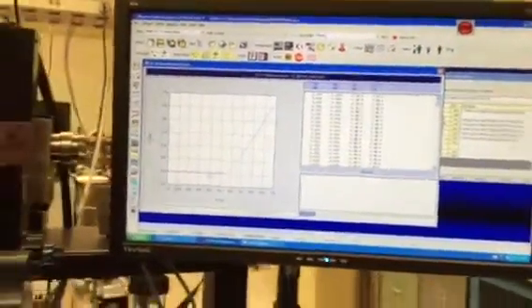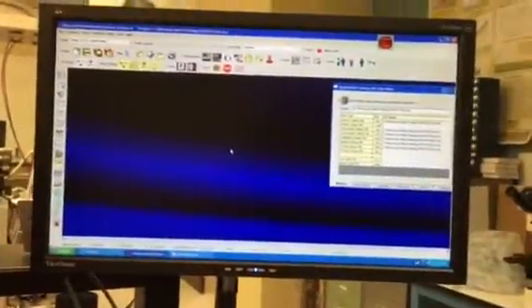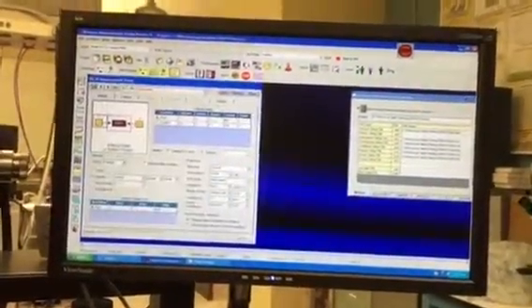You may see differences in the data down here. That's where you can see the noise. Okay, so that's basically we have a single measurement now that we can work with. But now we'll move to setting it up, and you can play with that. You can decide here how you'd like to do this.